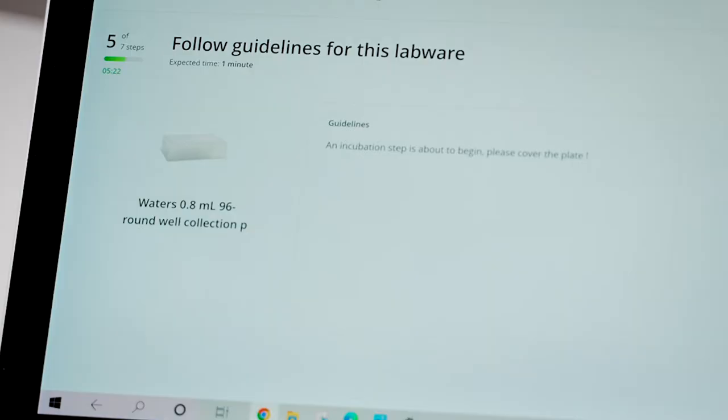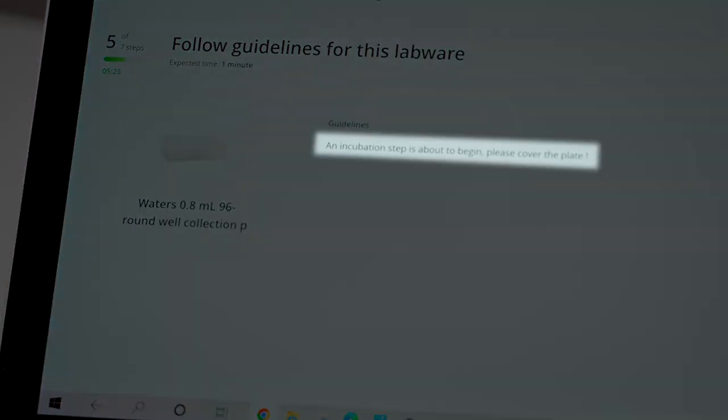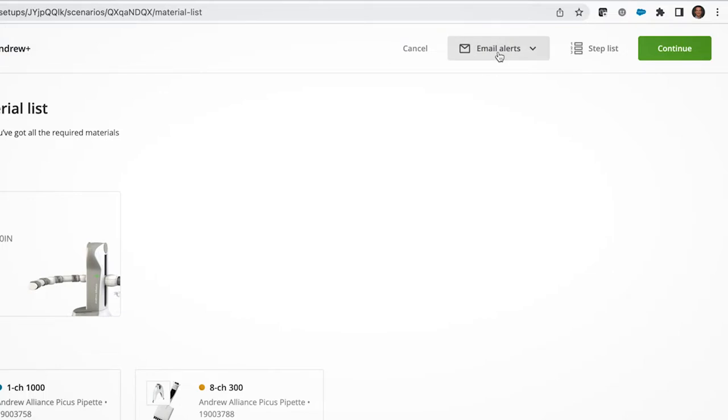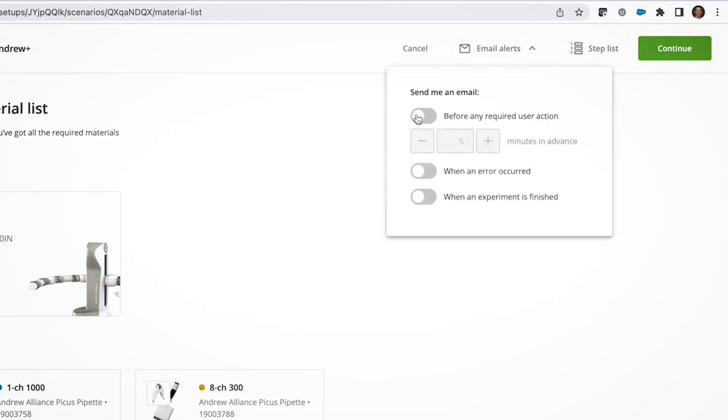And this is probably not news to anyone, but heating naturally induces evaporation. So when using a Heater Shaker Plus, be aware that lengthy incubation steps could require manual intervention for sealing or covering consumables. If this kind of user action is necessary, OneLab will remind you to do this in real time, and even send you an email if you want.